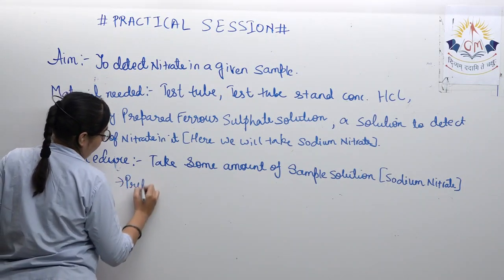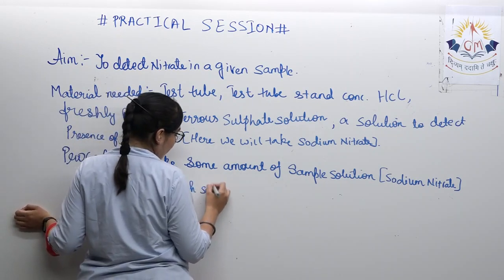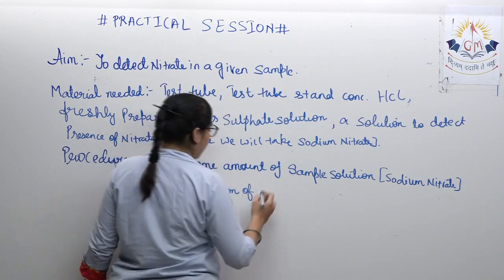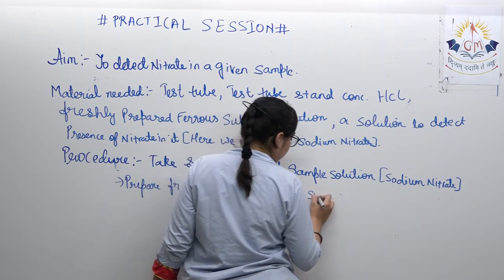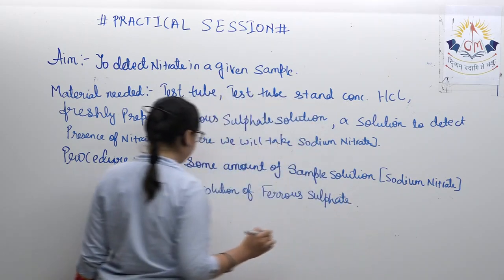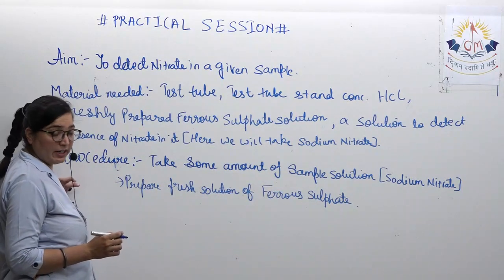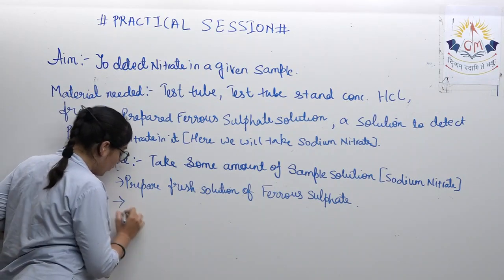Prepare fresh solution of ferrous sulfate. After preparing the fresh solution of ferrous sulfate, what do we need to do?